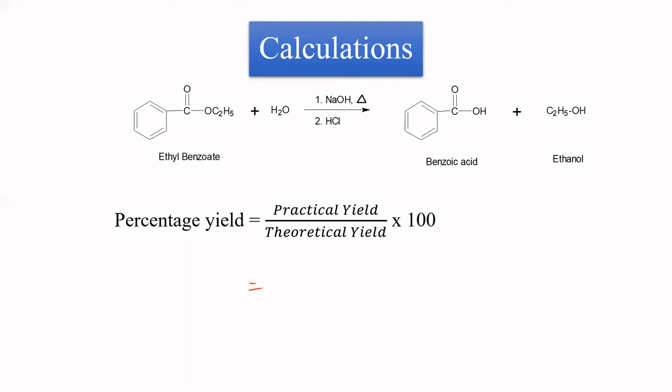It should be less viscous. And in that solvent, my compound should be soluble only on heating, not at room temperature. That is an important condition. My compound should be insoluble in the solvent at room temperature, but at high temperature, that is on heating, it should become soluble.